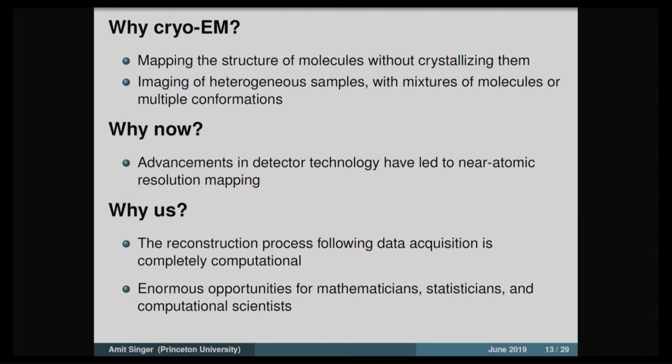So many proteins are not just rigid 3D objects, but they change their conformation. And because each conformation will be represented in the CryoEM data set, in principle, you should be able to not just get a 3D reconstruction, but actually a movie, if you wish, of all possible conformations and how they change from one conformation to the other.